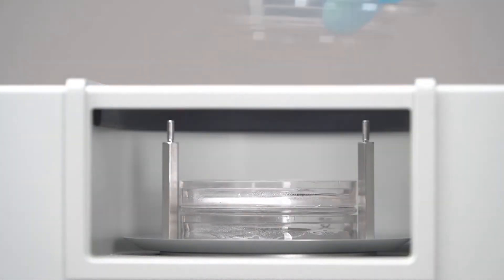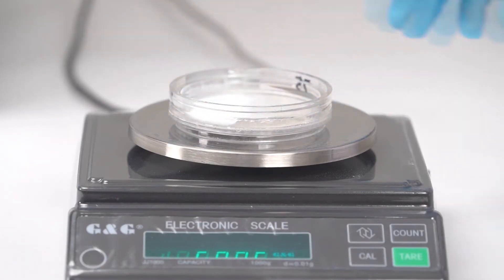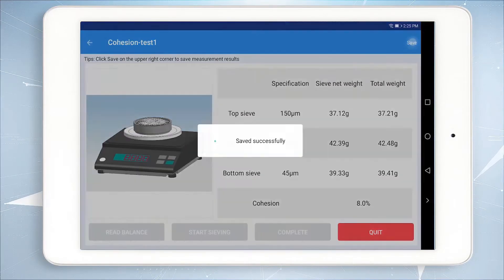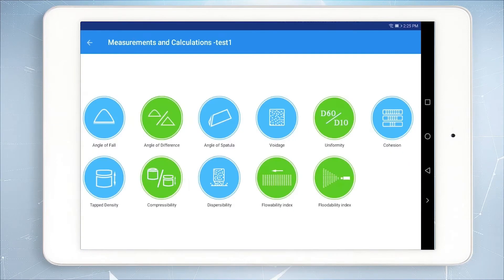After the sieving, use the balance to weigh the total weight of the sample on each sieve. Click Calculate, then click Save and Quit to complete the cohesion measurement.